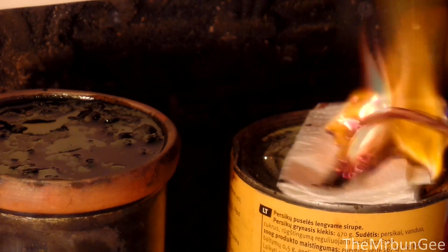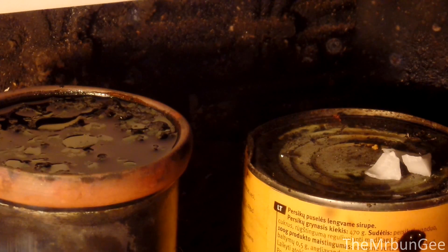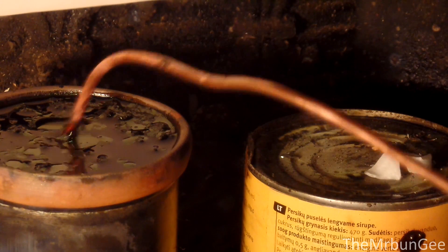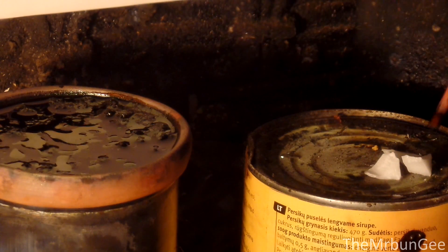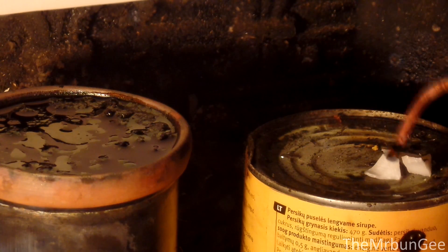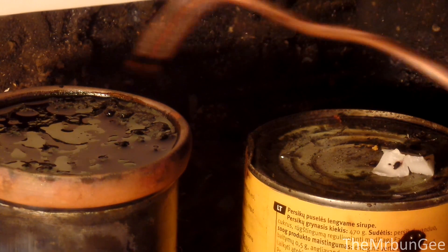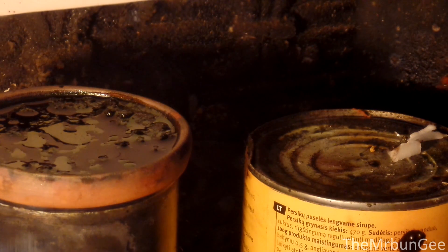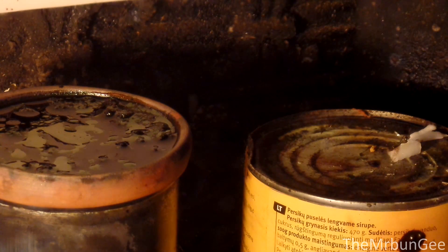Nice. Now let's move on to paraffin. I have to clean the rod so it would not add reducing stuff to the dish with heptoxide.